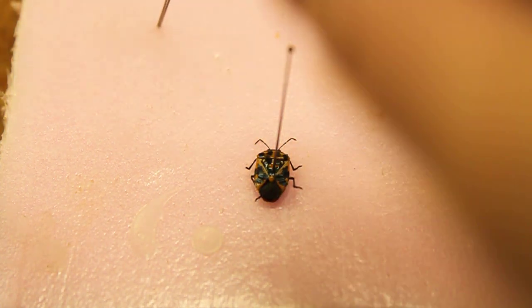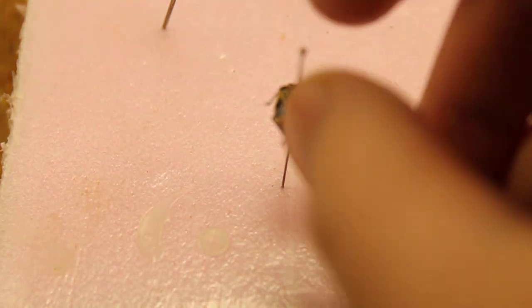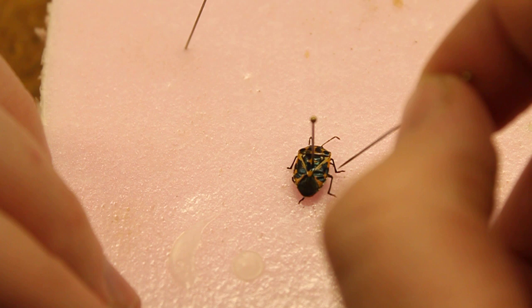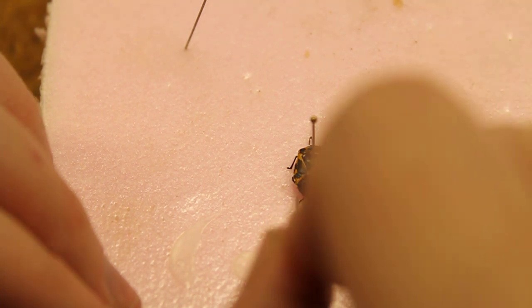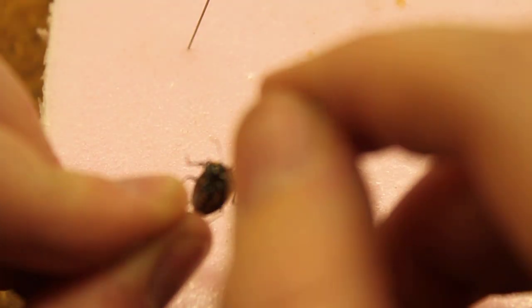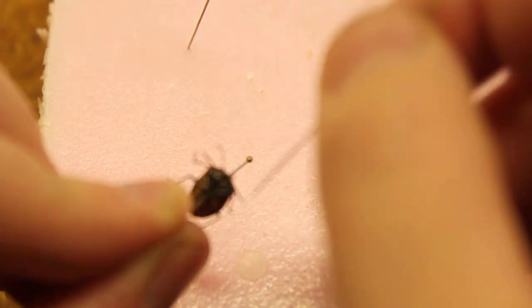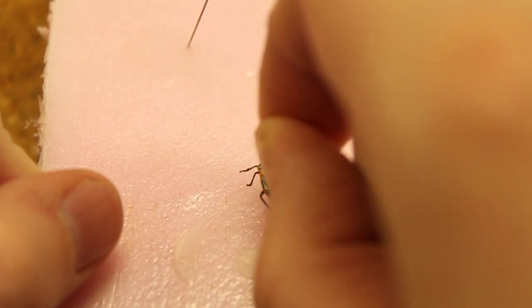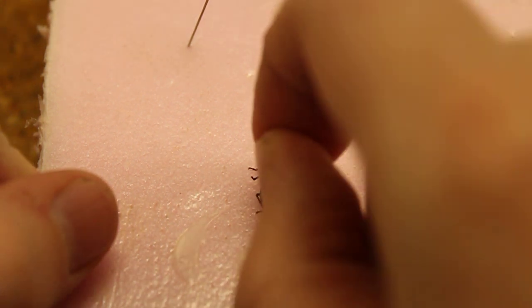Most of the time with true bugs you don't have to do much. With true bugs you normally just have to move the feet into position, and this one I'm going to have to pick up. There we go.